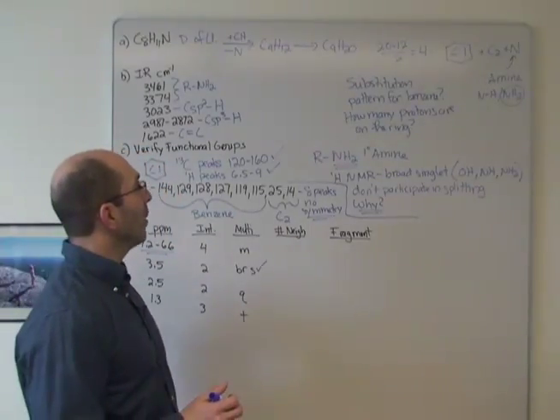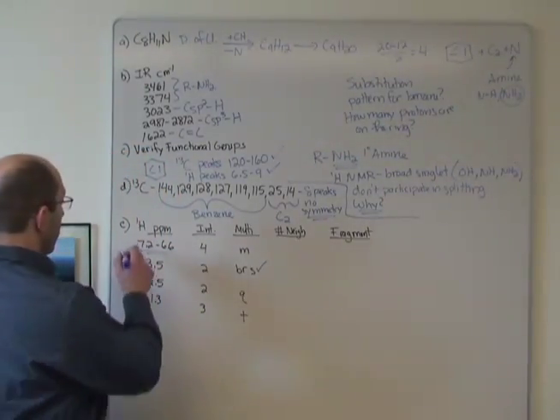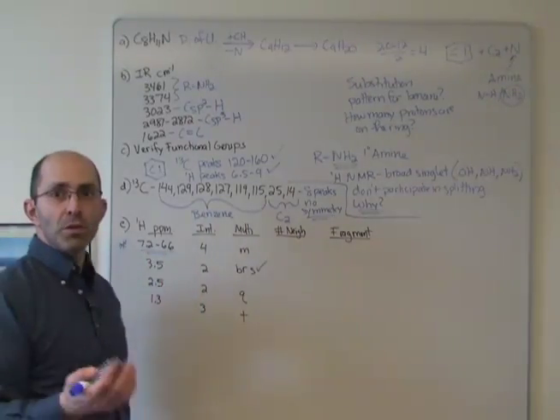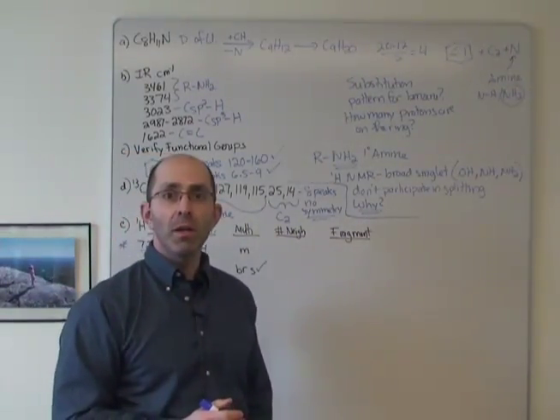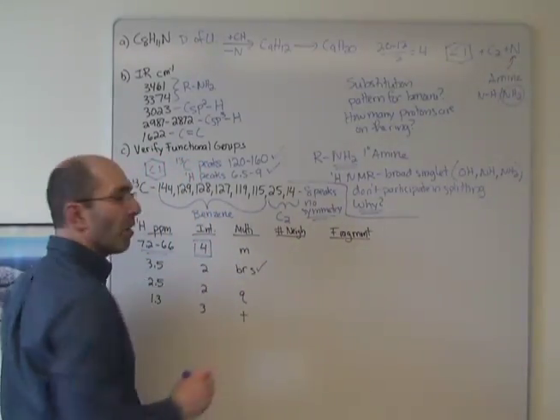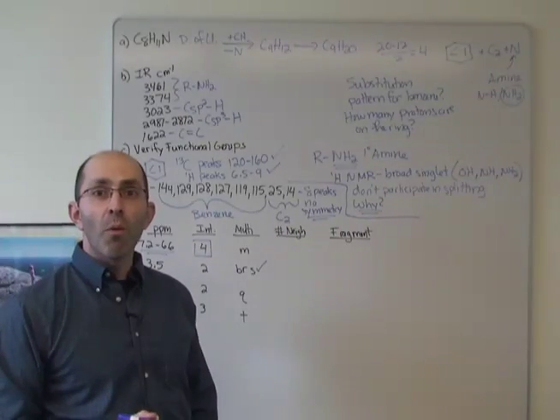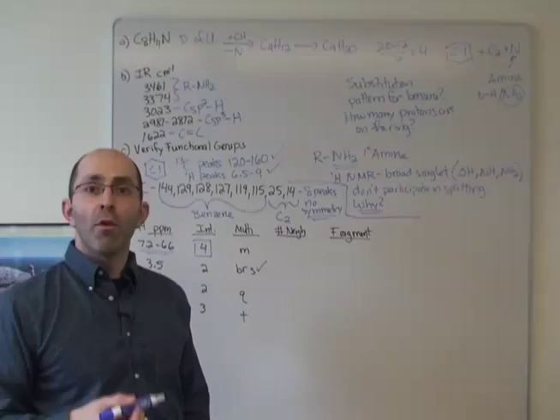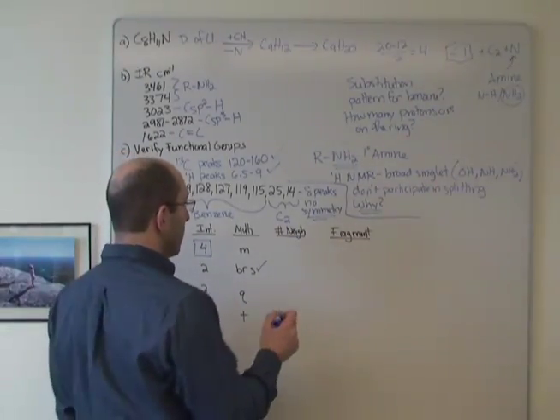So the easy way to do that is to look down in the aromatic region. Here's our aromatic peak. It's a peak that's called a multiplet, so there's a bunch of things going on in that peak. But the most important point is that it integrates to 4. That tells you that you have 4 protons coming off the benzene ring. Really important. So we have a di-substituted benzene.